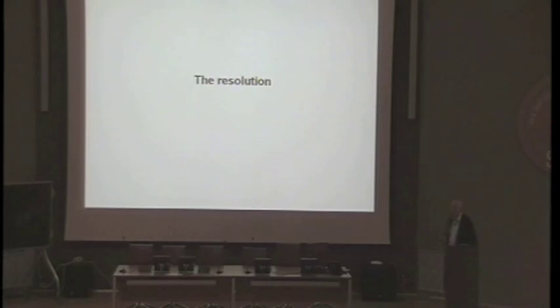You've seen all kinds of numbers as far as the resolution is concerned. Something like you've seen 70, you've seen 30, you've seen 15. And so some of you will ask the question, what is the kind of resolution that we get with this method? Is it 15? Is it 70?